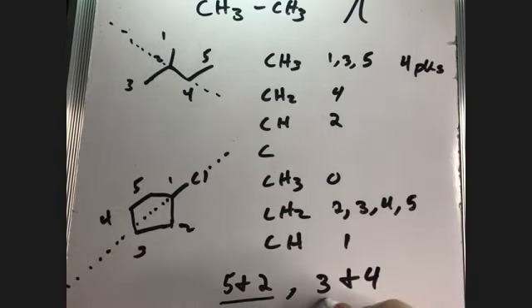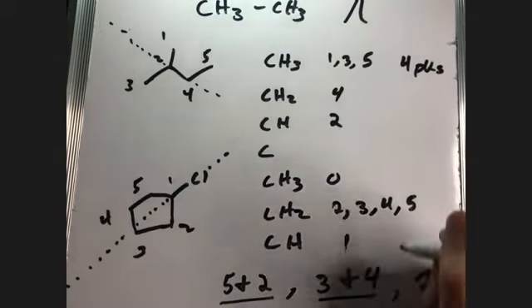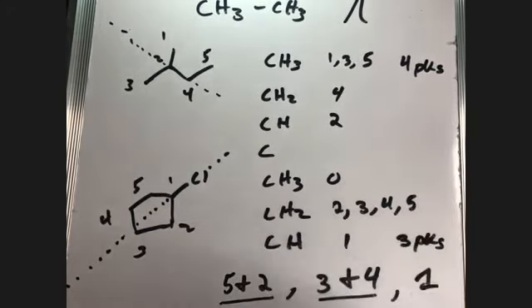Because these two are the same, and then these two are the same, and then carbon number 1. So, 3 peaks for this NMR.